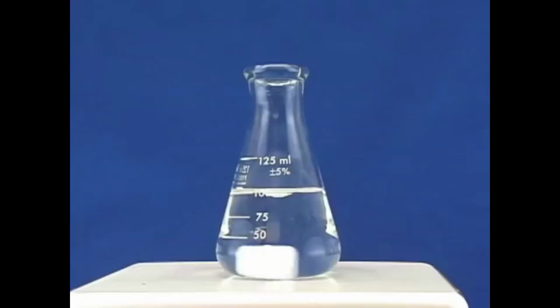In today's video, we are going to tackle a simple precipitation method to synthesize zinc oxide nanoparticles using zinc nitrate and urea in aqueous solution.